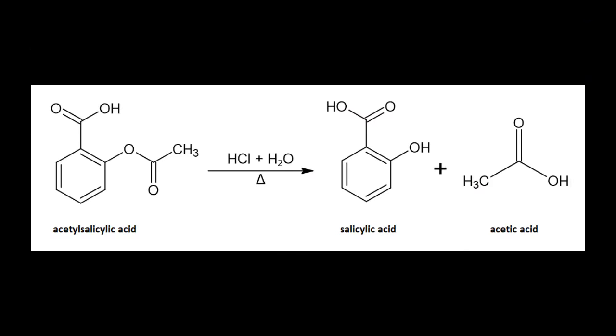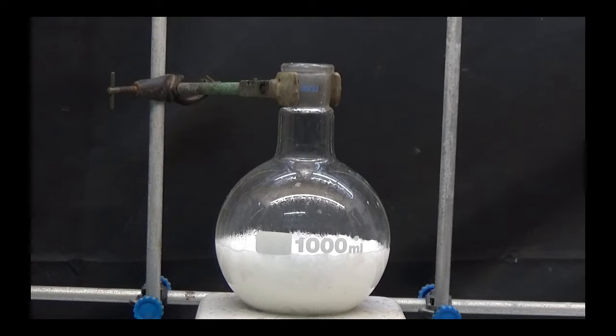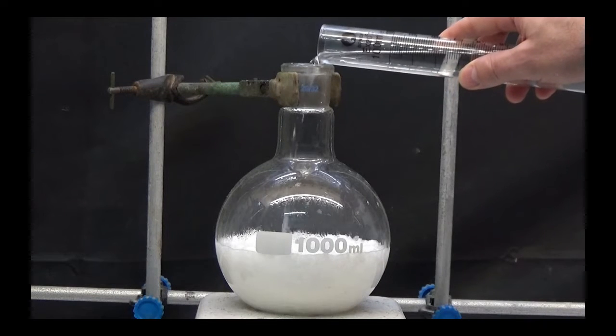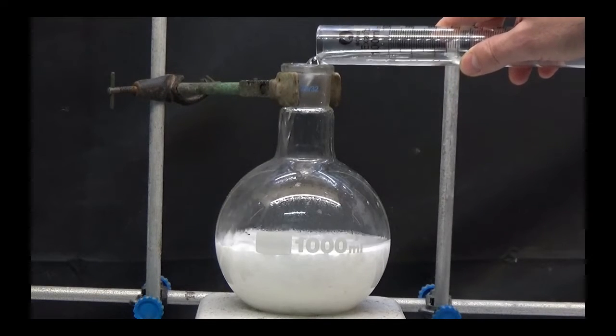Heating acetylsalicylic acid with dilute acid causes the acetyl group to hydrolyze, resulting in the formation of salicylic acid and acetic acid. By allowing it to cool, a significant amount of salicylic acid crystallizes.